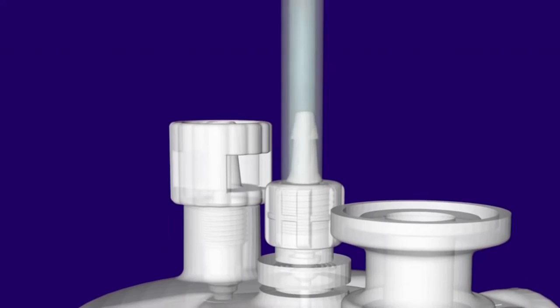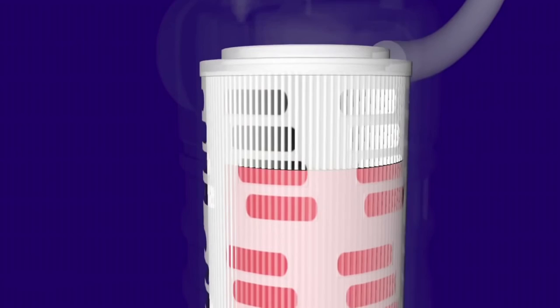The sterile filtered gas pushes liquid out of the capsule and downstream to the next stage of process or recovery without contamination.